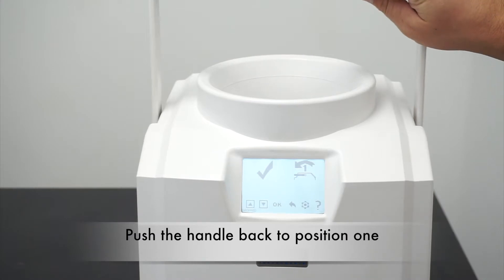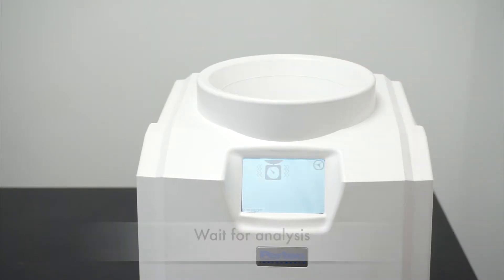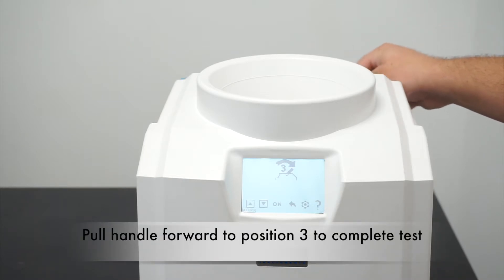Push the handle back to position one, and then all the way forward to position three to finish the test.